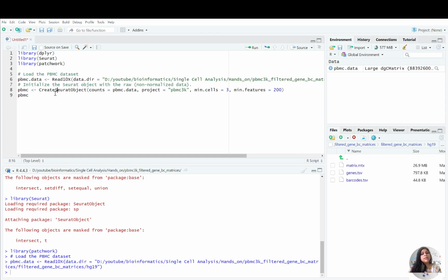But if we go to other protocols such as Visium and Xenium data, which deals with spatial transcriptomics, you don't only have the metadata of what is the expression level, but you also have the spatial coordinate of where each cell is present in the particular tissue sample. You also have another data showing protein expression level. So in one single object, you keep all that information in different layers as different assays.